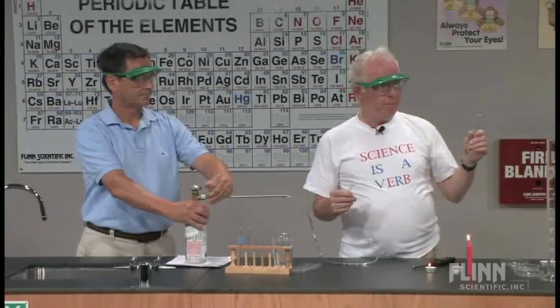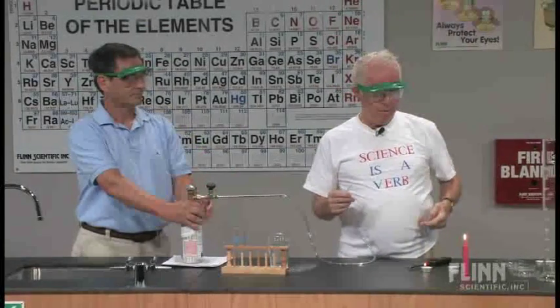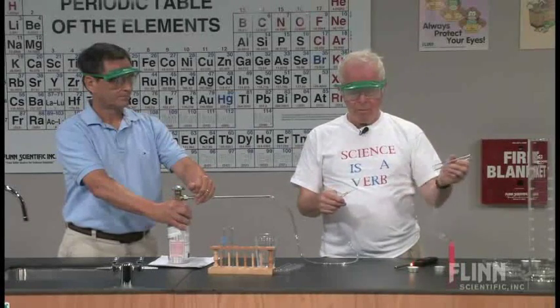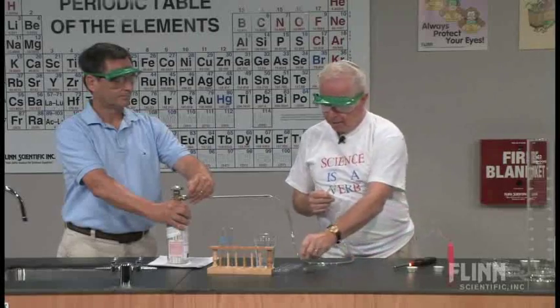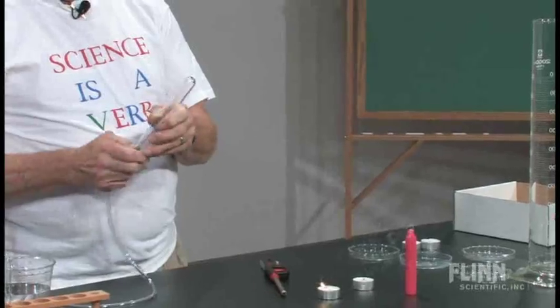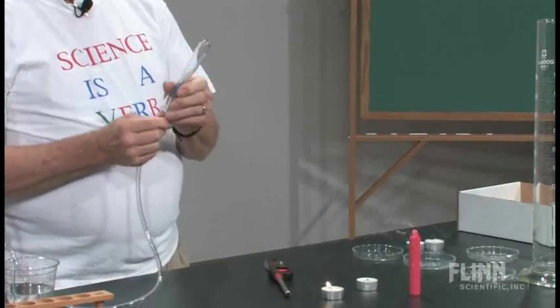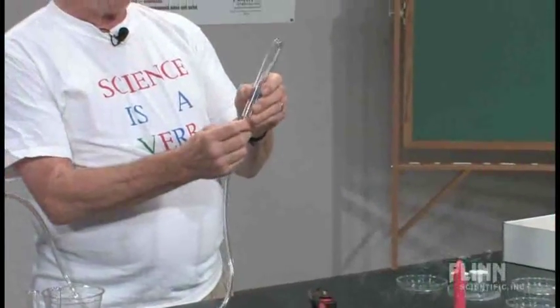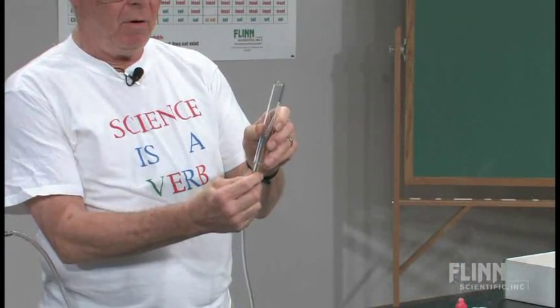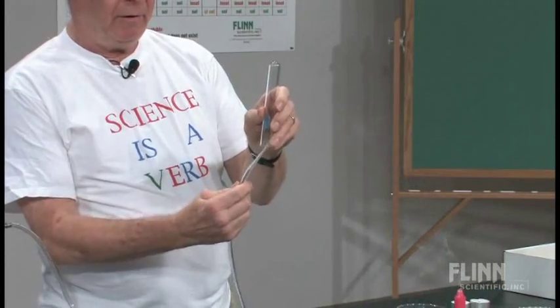I'll get very impure hydrogen. Nothing happens. Now let's repeat that, and when I take the tube out of here, give me a very, very slight gas flow. Very slight.